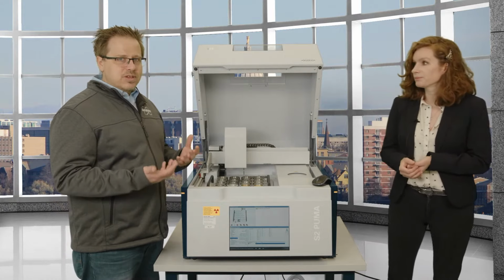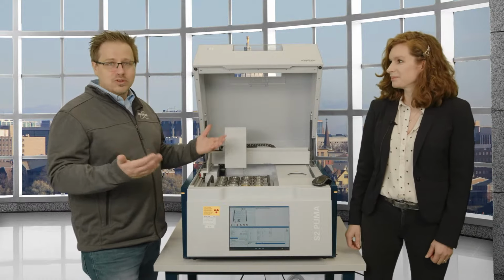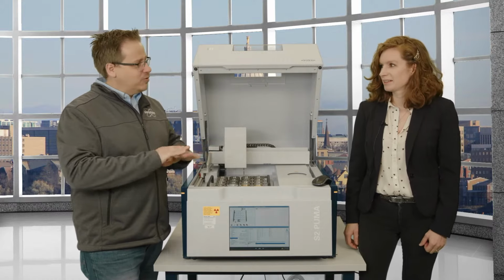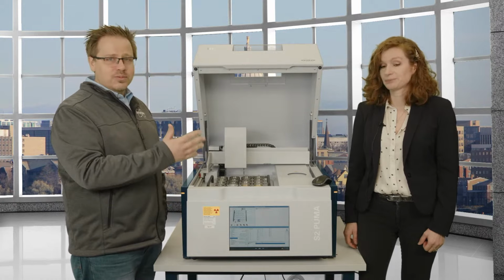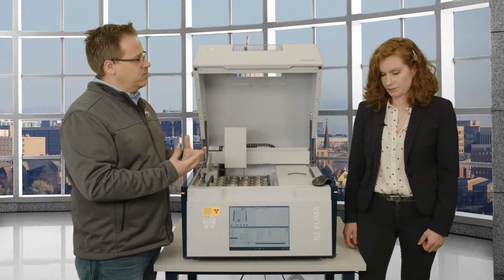Yeah, and that's the big thing with any analytical technique. If you're in the market for a machine and somebody comes to you and says, this is the end all, this one technique will give you everything, I'd run away from that, because the reality is that each one is a piece of the puzzle. Some pieces are a little bit more important, some of them are auxiliary, but every piece gives you a clearer picture of what's going on.